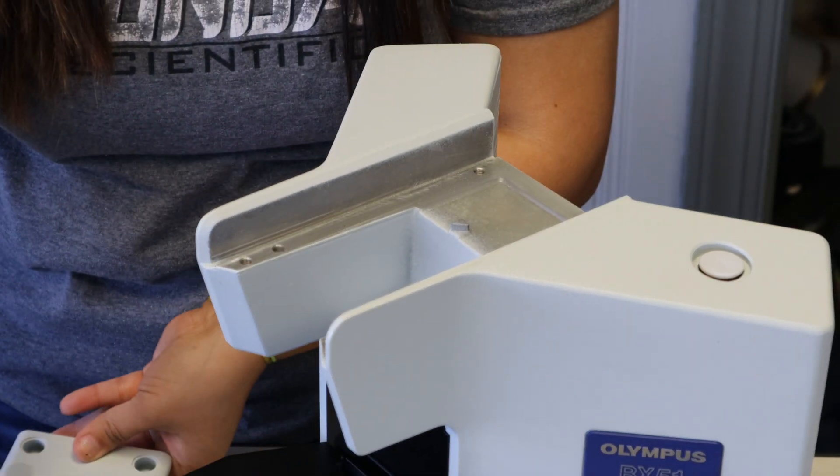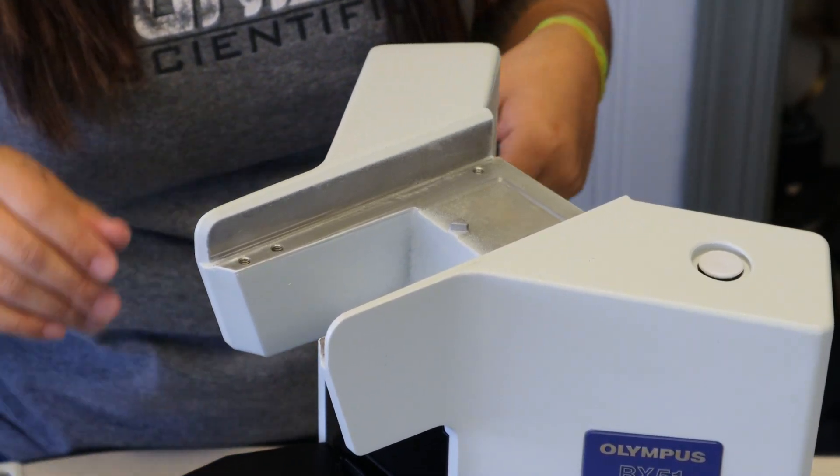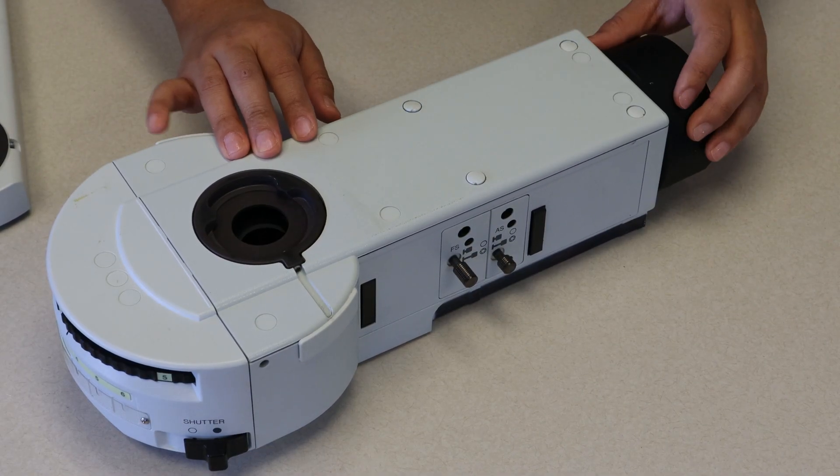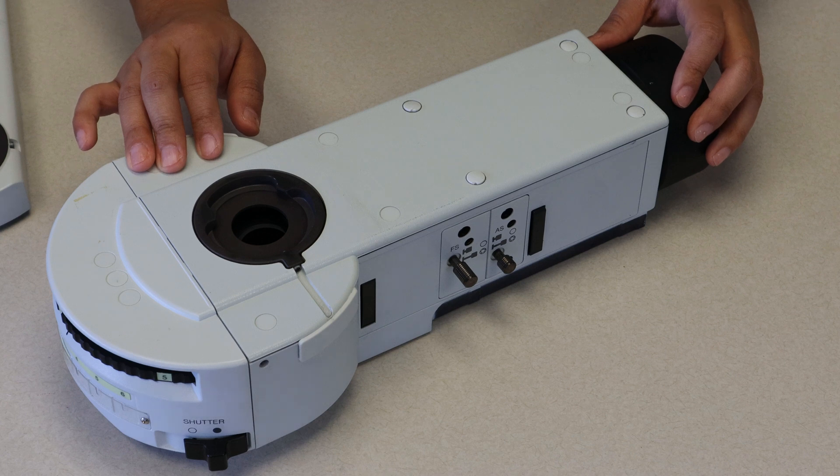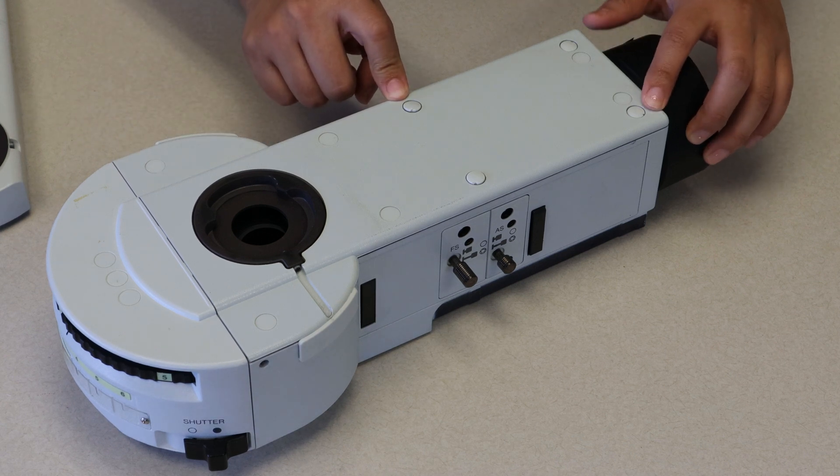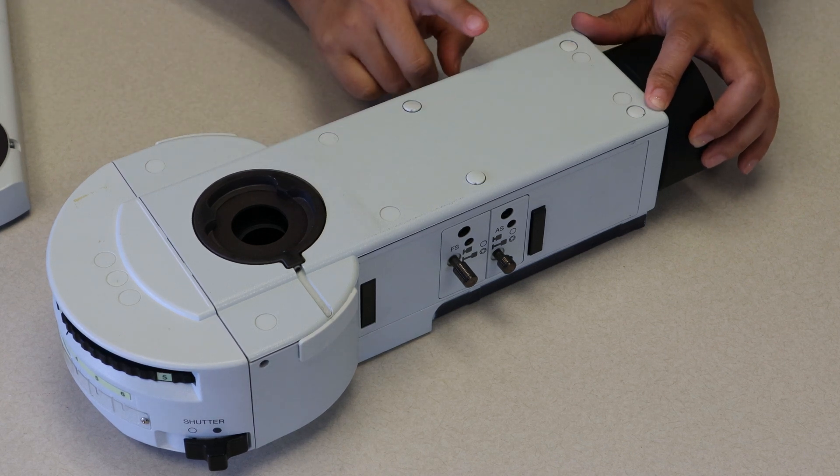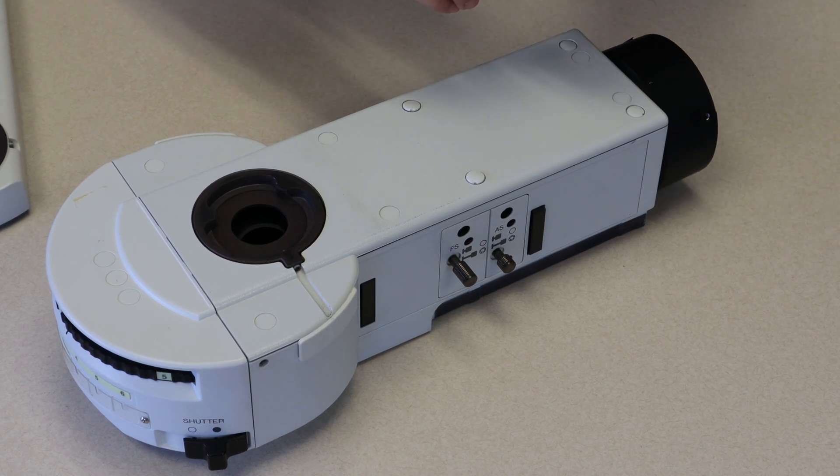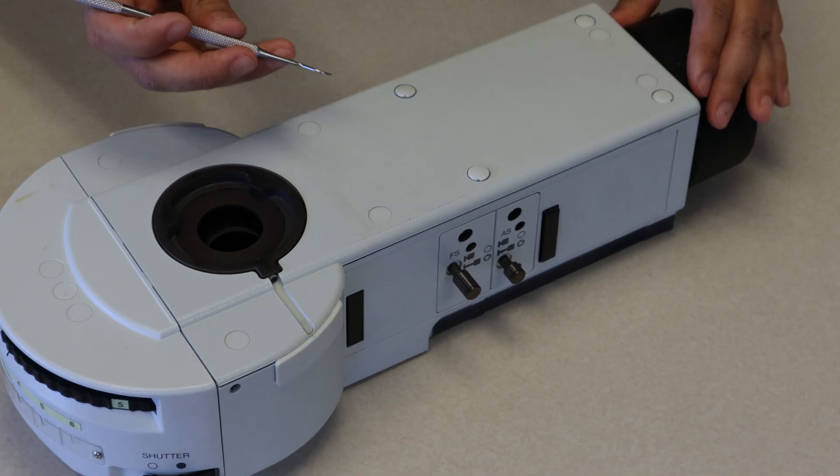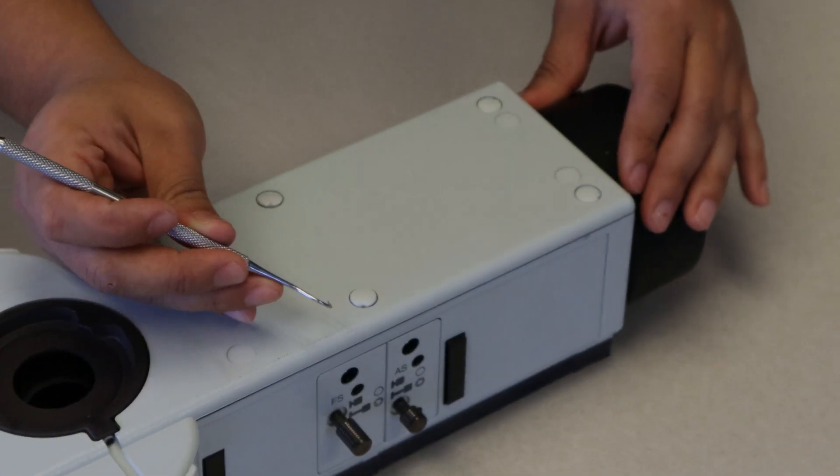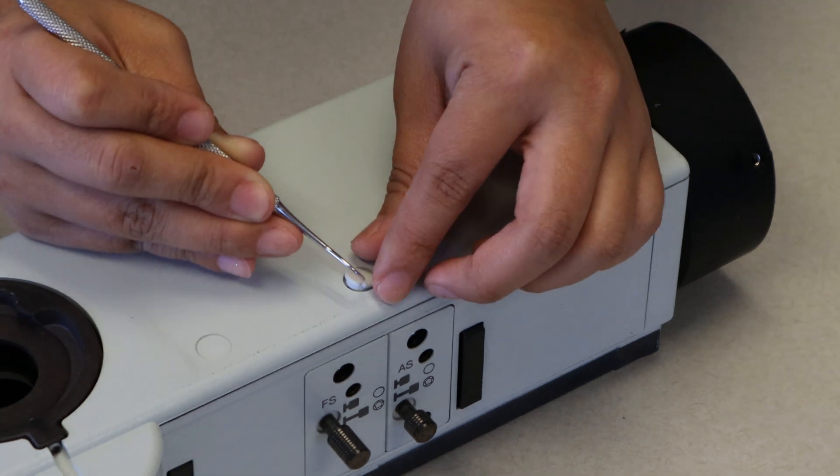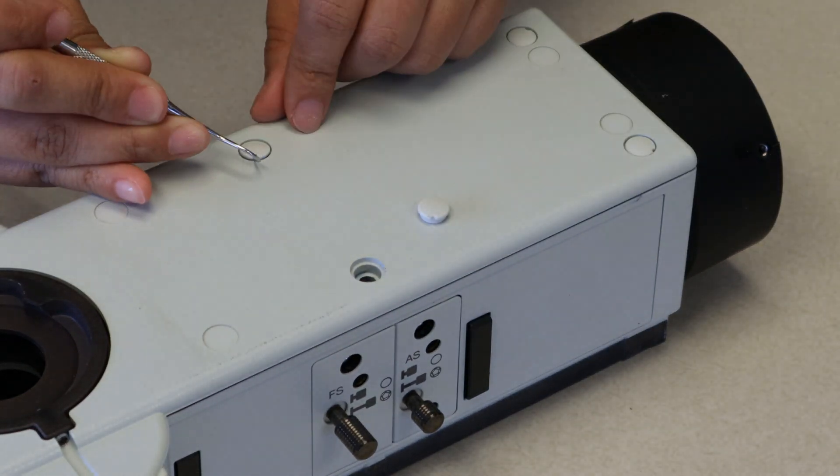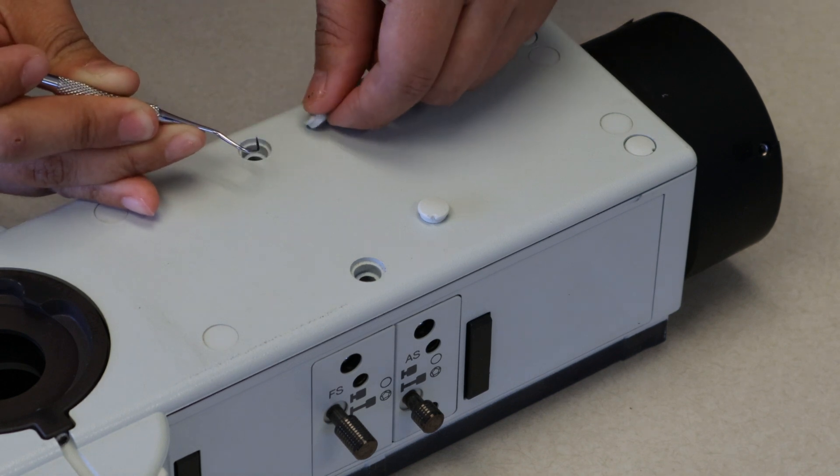Now we're going to move on to installing our fluorescence attachment. So here we have our fluorescent attachment. We're going to go ahead and use our little pick tool to remove the four covers over the captive screws in the top of this attachment. And once we get those out of the way, I'm going to take a second to pop them out, you'll be able to bolt on your fluorescent attachment to the original stand. Just move this up to the side so you don't lose them. Next we're going to be showing you how to put this attachment on top of the microscope.